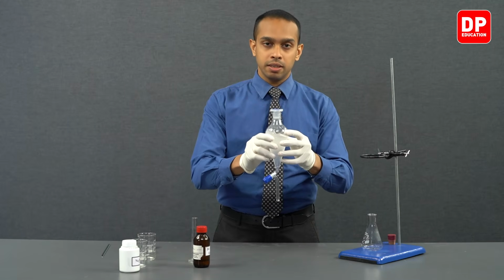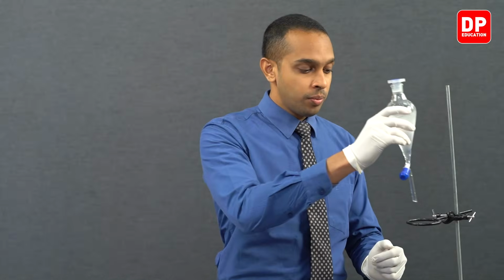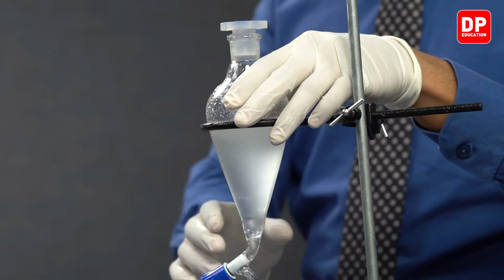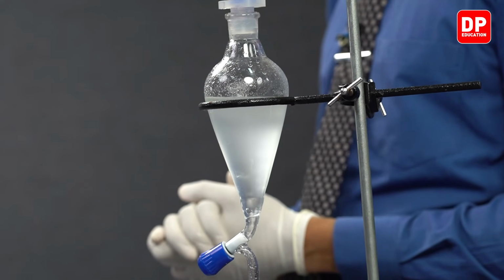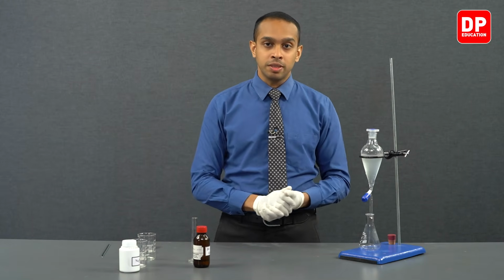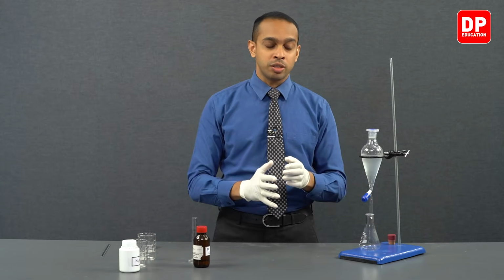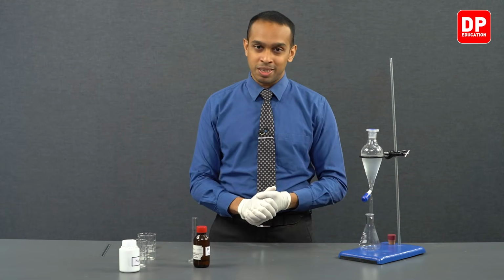After mixing it a few times, you can then place it on our retort stand here and allow the two layers to separate. And after the two layers have separated, we can remove our organic solvent layer with the use of this separating funnel. And then we will repeat this process 2 more times to extract the most amount of essential oil from this aqueous mixture.